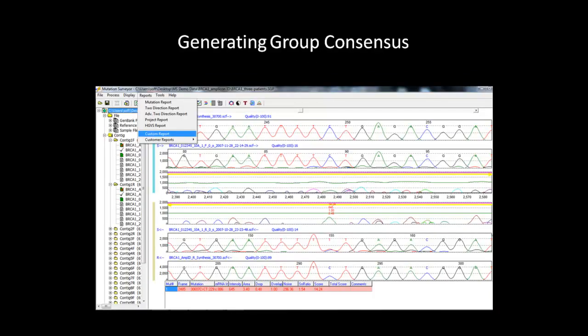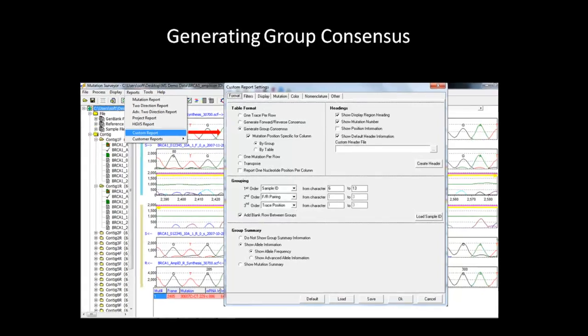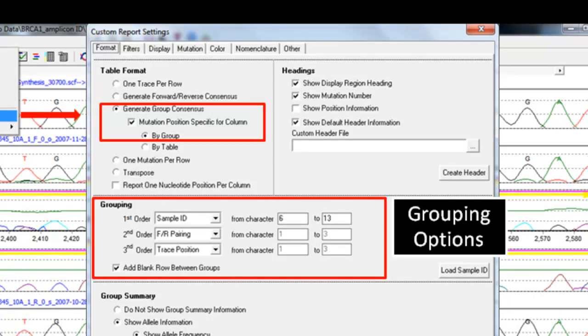In addition to the project reviewer, you can also use the custom report as a means to check for discrepancy in your data. It can be accessed from the report tab on the main menu toolbar. The settings dialog box will appear. First, we want to generate a group consensus for each patient relative to the variations. Then, under the grouping header, from the drop-down menu of the first order, select sample ID. Then, specify the characters you want to group by. In this example, I am using the same characters I used earlier to group the three patients. Click OK and the report will generate.